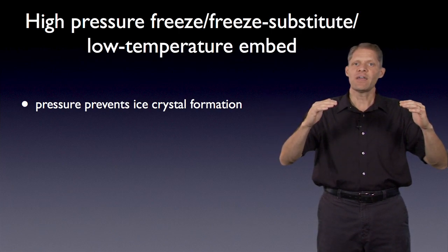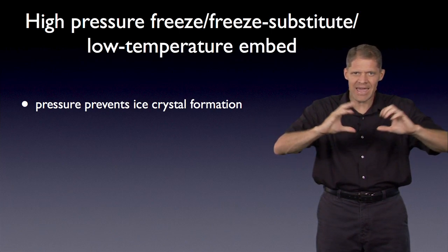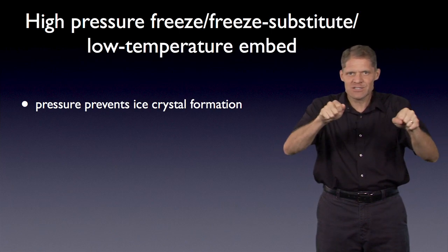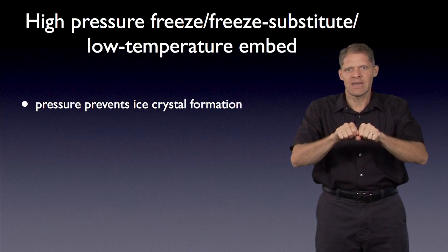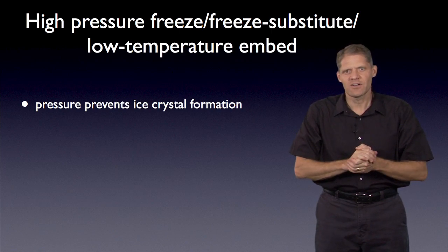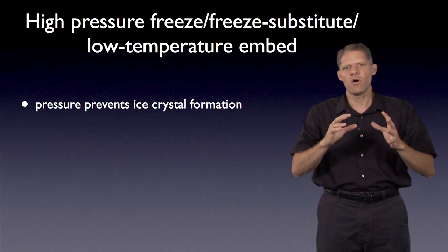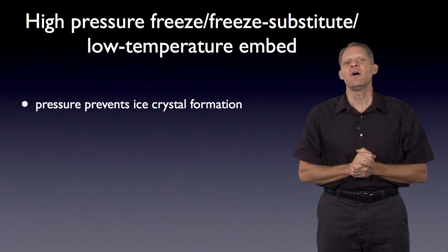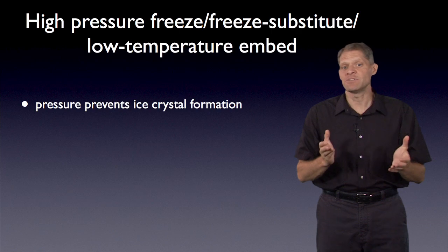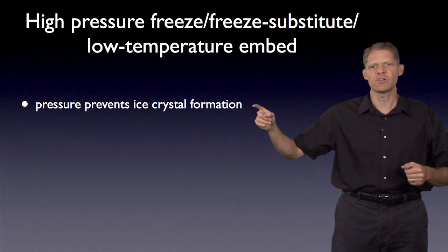However, if you apply very high pressure to a block of tissue so that it can't expand, and then you cool it, the water can't expand in an ice crystal, and it stays more nearly in a liquid-like state. There still may be lots of little microcrystals, but they don't grow and rip the cells apart as they would if you very slowly cooled the cells at atmospheric pressure. And so the pressure prevents ice crystal formation.